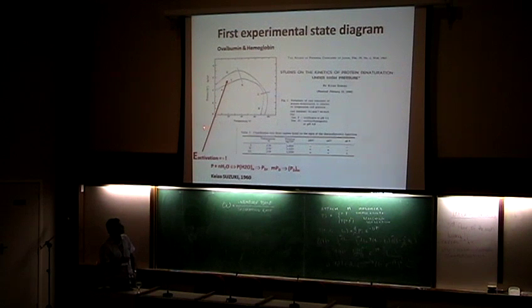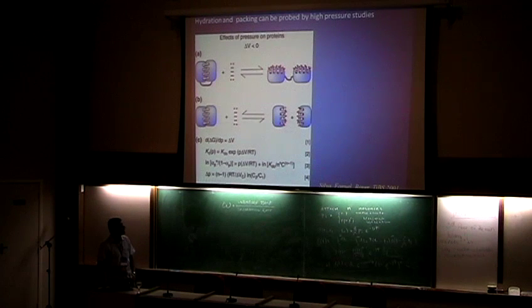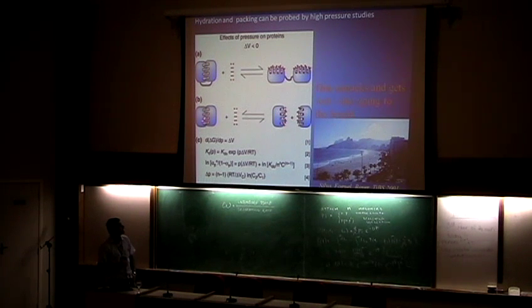So he designed the PT diagram. And we and others have used high pressure not only to denature protein, but also to dissociate. So that's a very simple cartoon that, when you try to sell the technique, you try to make it very simple, and it's not simple at all.